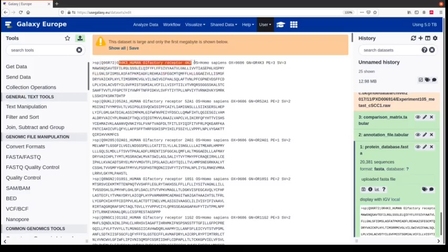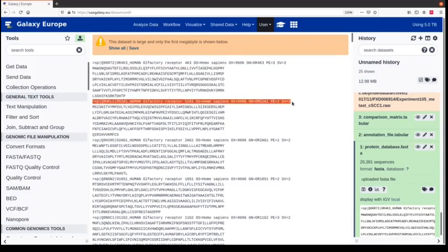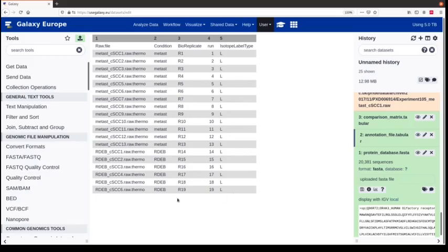This is a human protein database with 20,000 entries. The first line is the header line containing the UniProt ID and more IDs and the name of the protein, followed by the actual amino acid sequence. Then the second protein starts. The annotation file is important because for the statistical analysis we want to compare our two conditions — the metastasizing tumor type and the RDEB tumor type — to find differentially abundant proteins between the two groups.